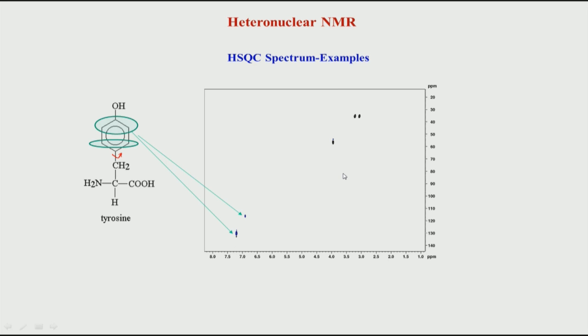Okay. So, we can see like this, we have covered different types of amino acids and different types of structures and looked at how the peak pattern looks. In the next class we will move on to HMQC, which is another experiment very similar to HSQC, and then another experiment further is HMBC, and that will tell us how the different experiments work. As we saw, HSQC is not sufficient just for assignment. HMBC helps sometimes when there is an ambiguity, and that we will see in the next class.